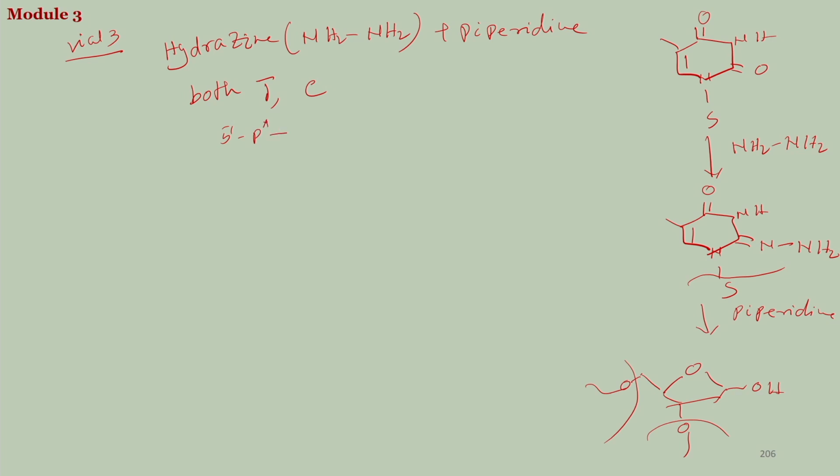So, if your sequence, I have to read again, GCTACGTA, that is the primer sequence. So, the fragments in vial 3 would be here parallelly P, wherever there is T and C, it will be cleaved here and it will stop. So this is 1, P, G, C, it will cleave the T also, done.